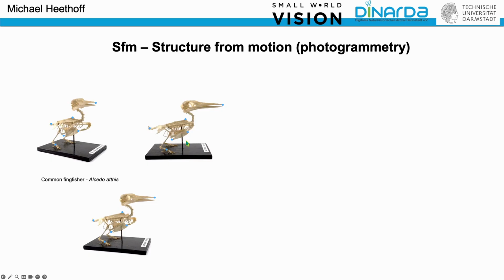This was meant for object detection at the very beginning. And now the question is, how can we use these feature points in 3D modeling? Because that was not the initial intention.